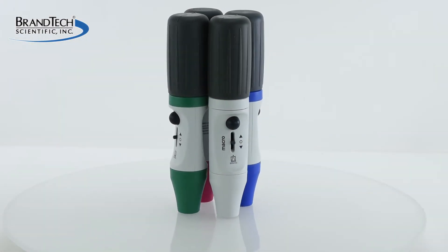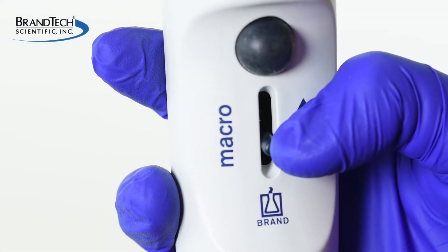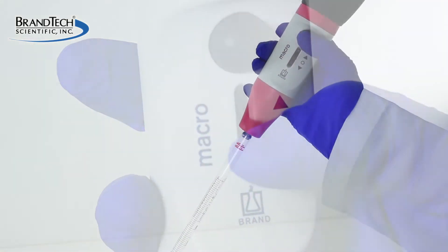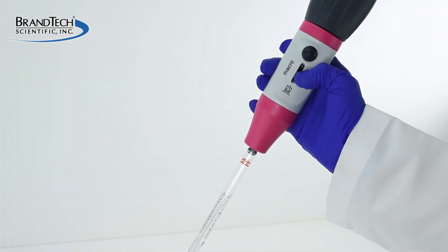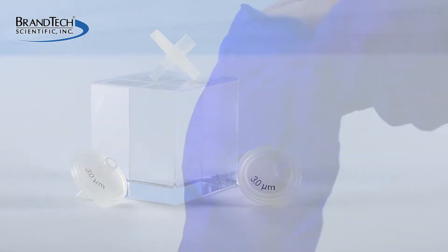How to change the filter on your BRAND Macro Pipette Controller. BRAND Macro models feature a lever that offers smooth pressure-sensitive speed control and a bulb for blowout. This video will demonstrate how to change the protective filter on the Macro Pipette Controller.